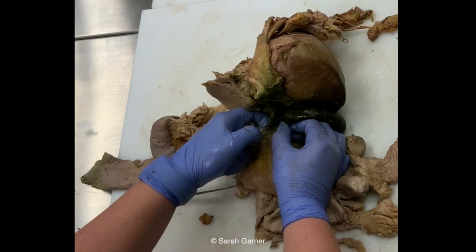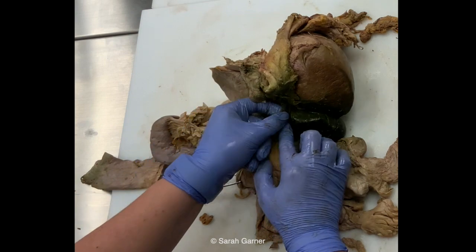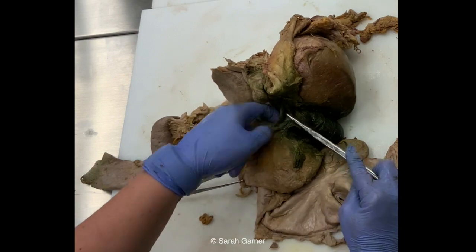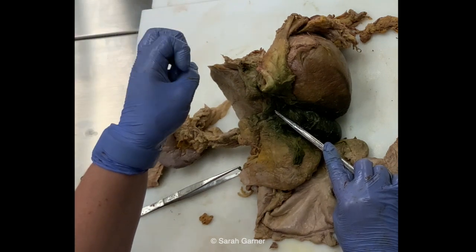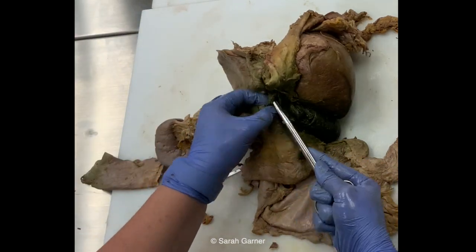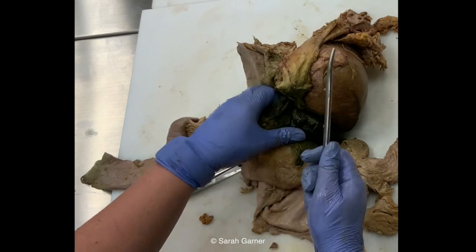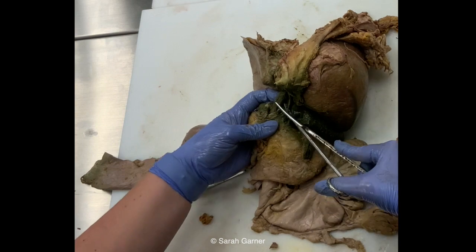Then you have your artery. At this level, it looks like it's probably gonna be your proper hepatic artery already. It already gave off the gastroduodenal. That's gonna be this guy. And then back behind that is gonna be your hepatic portal vein, which should be the biggest, not the thickest, but the widest structure. Now that you've identified them, you can feel comfortable cutting them. Say you have a filter in here and you're slicing across it with a scalpel, you could dislodge that, you could cut yourself. So just make sure you know what you're cutting.